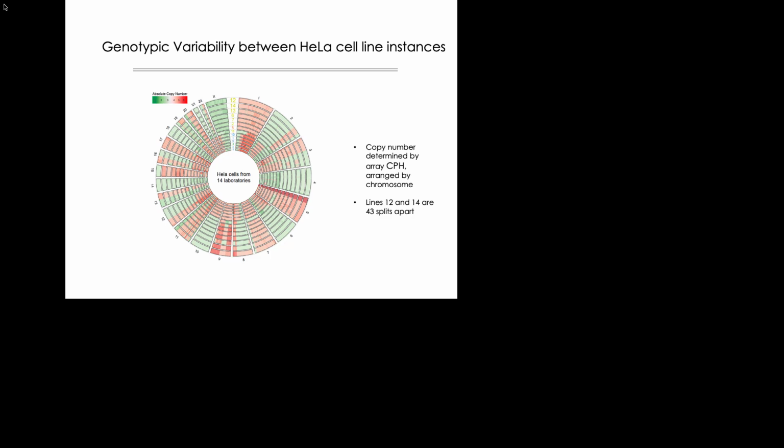And we see differences between cells. We see differences which are quite distinctive, and we see big blocks. And here, for instance, is a block that's consistently multiplied, and we also see blocks which are multiplied only in some of the cells but not in others. So they are genomically quite different, and that was observed.